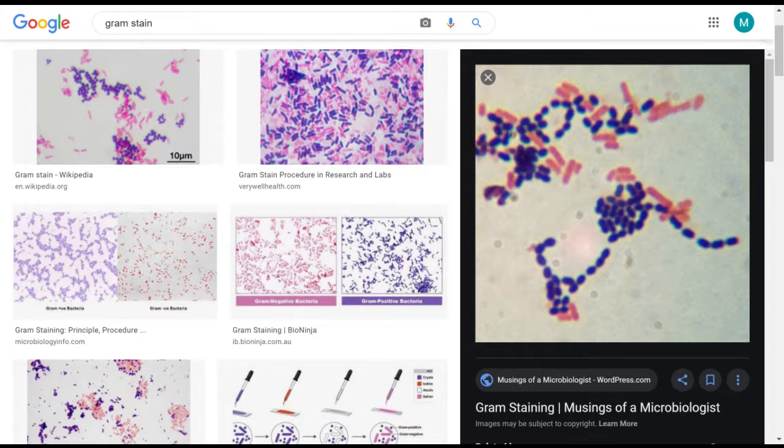These are, and I can see how you would think, okay, Cocobacillus. No, the problem is that the cocci that are in chains, capsule shaped, I guess you could say they were capsule shaped, but that's not a choice of shape. The cocci that make chains are oftentimes ovoid. They're either ovoid or they have kind of tips at the edges. Ones like these, they're cocci. And it is not necessarily you guys. Yes, I agree with you that you could call these a Cocobacillus. However, when you read the description of the cocci that make chains, they're described as ovoid. When you look at them, they're oval. They're little ovals with pointed ends sometimes, but they're gram-positive cocci.